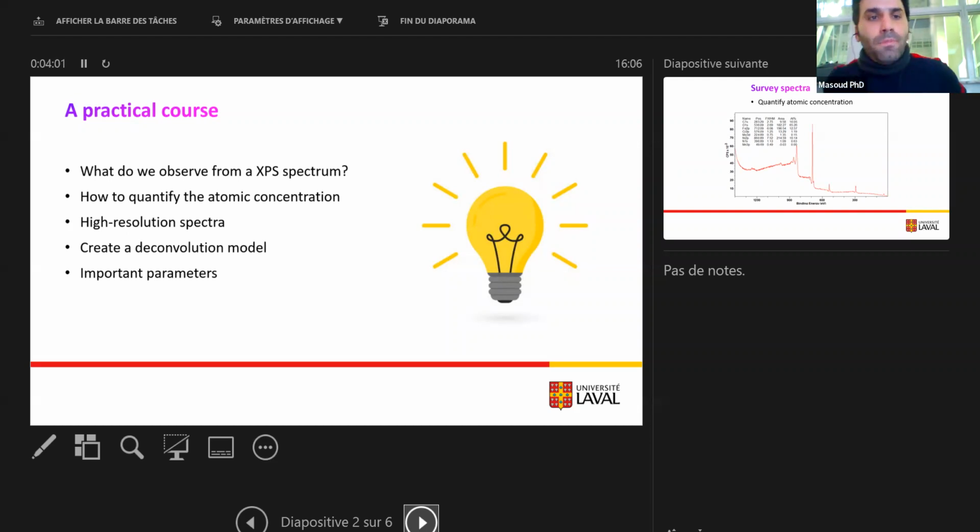So first of all, if you have XPS data, you need to make some first observations, to know what we observe from a typical XPS data.